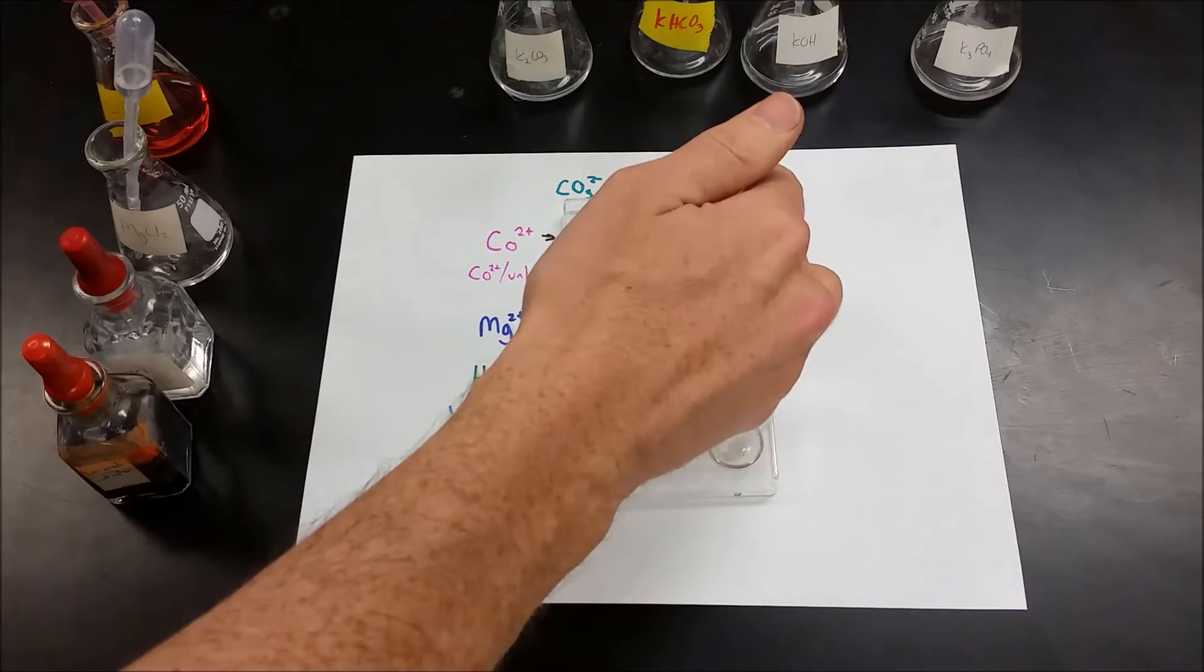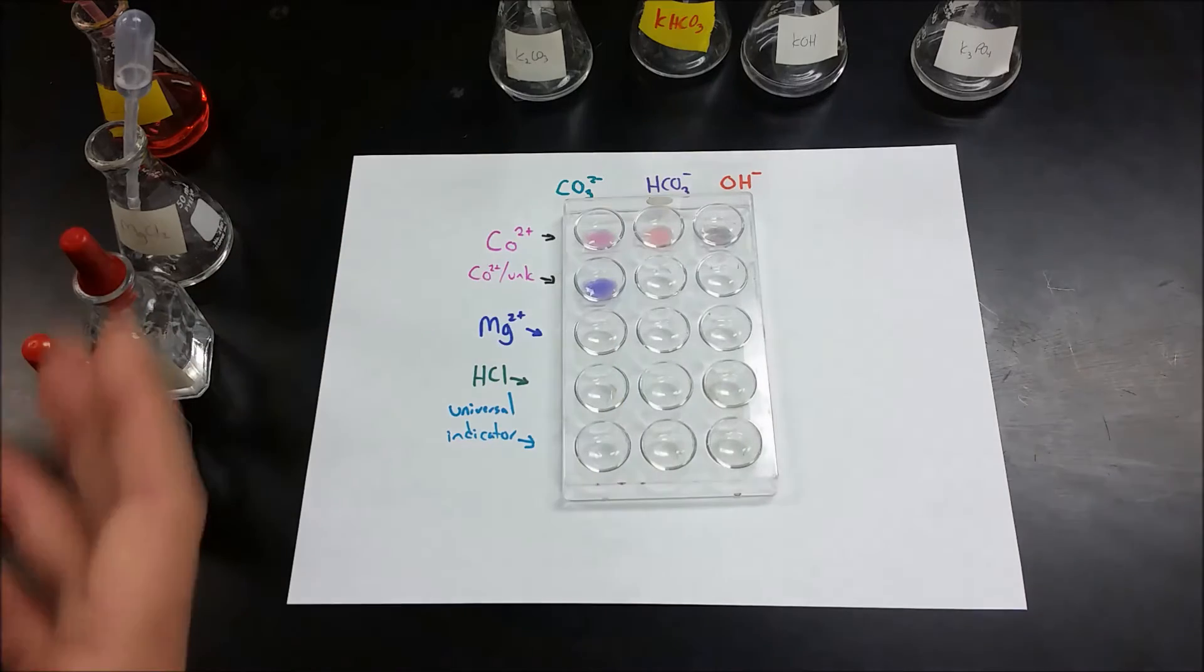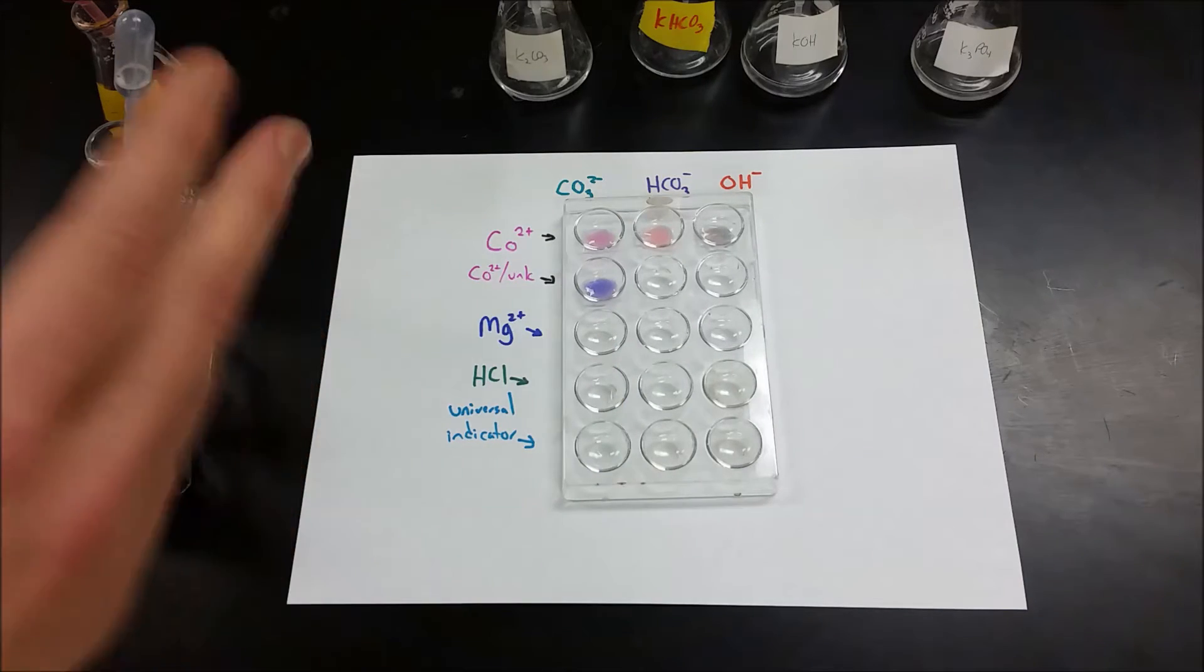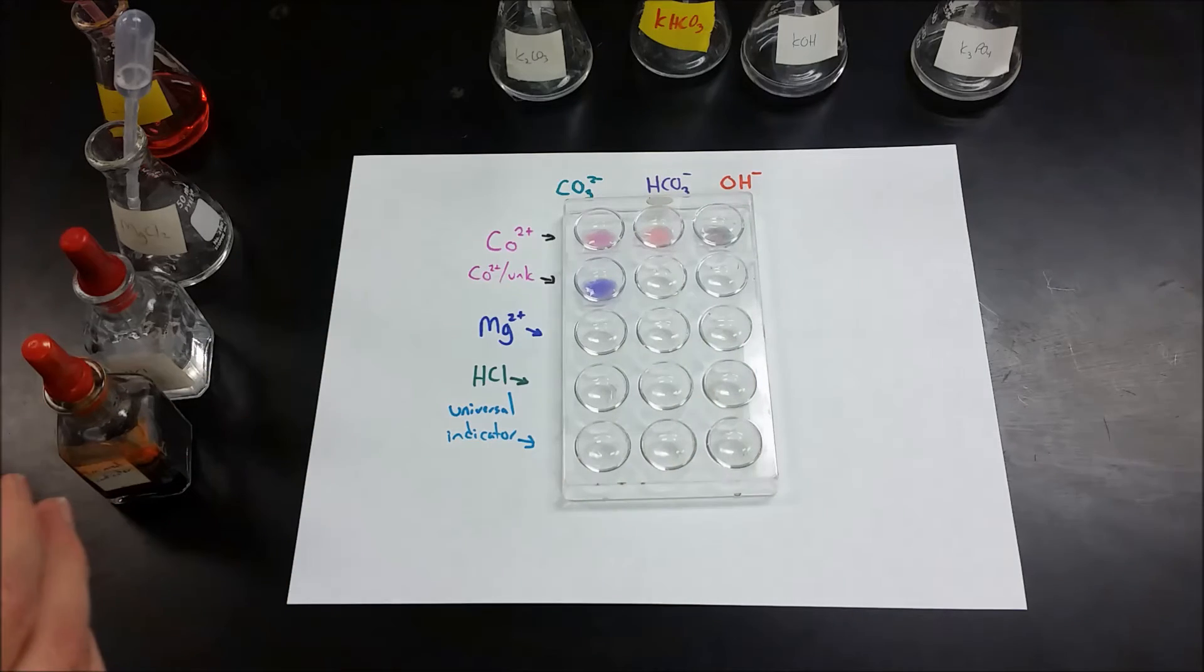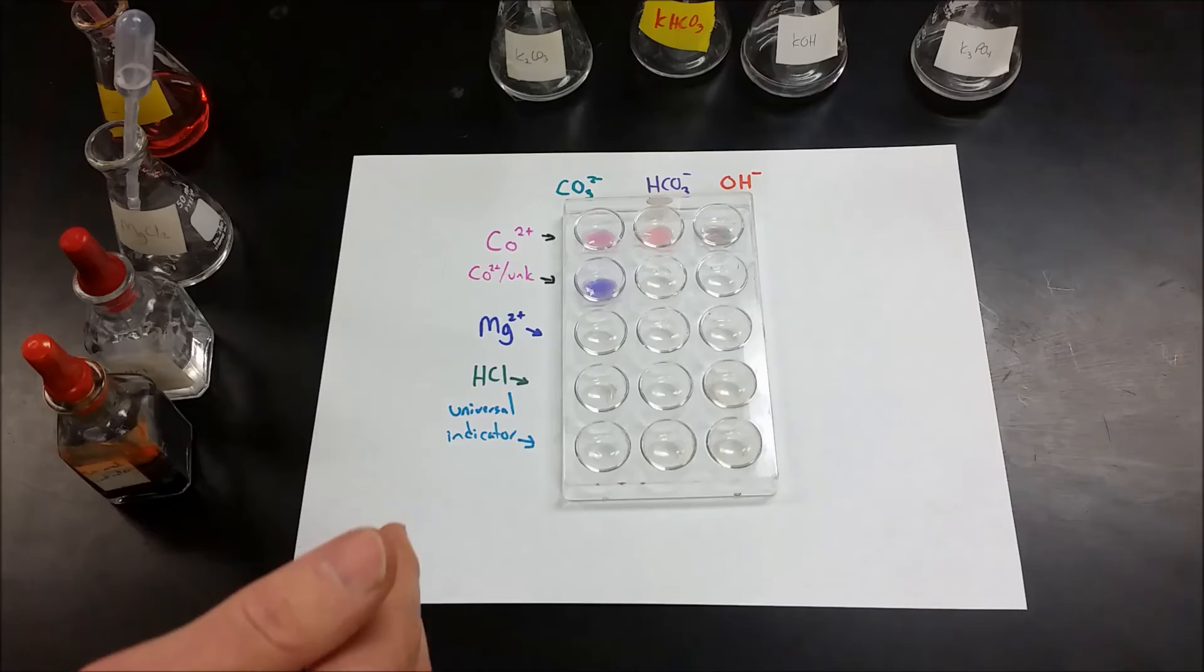Now, if you get this down to a hydroxide at this point, you can go through the rest of the testing to make sure it matches up, but basically you're done with that. If you're down to a carbonate and bicarbonate, you want to continue on testing to make sure that you can tell for sure which one it is.